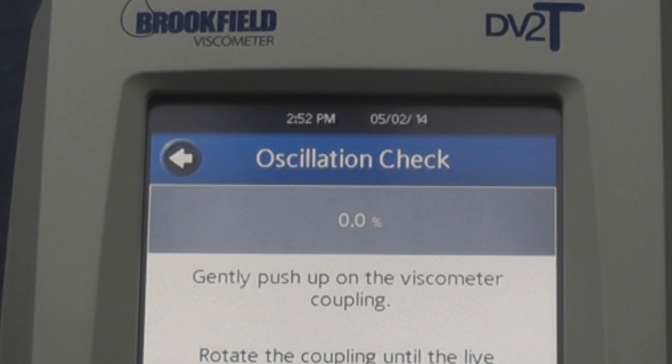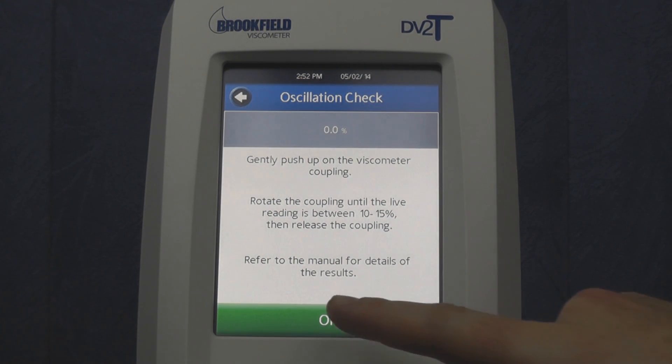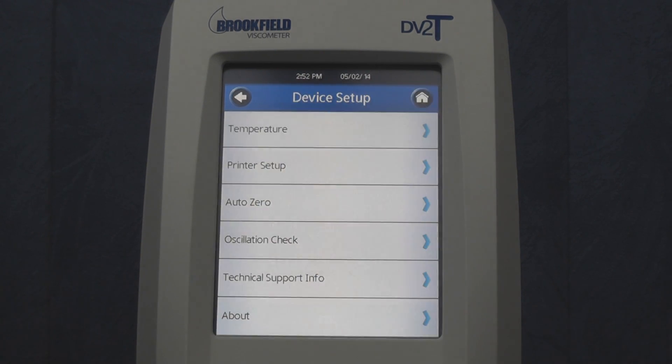When completed, the torque should read 0.0%. If it is off by plus or minus 0.2%, then it is still acceptable and passes the oscillation check.